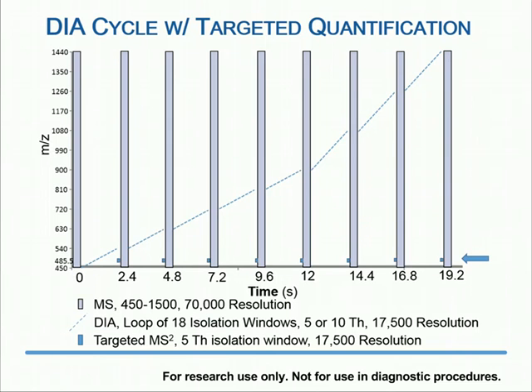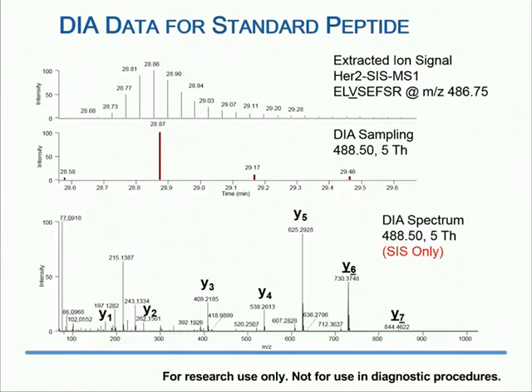If we find that we can do effective quantification, capturing these in the same tandem mass spectrum with a single spectrum, what we would probably do is just tune all of our DIA windows to make sure that they were centered to capture the endogenous and the stable isotope-labeled standard. But for this point and for the data that we already have, we think adding the targeted MS2 is a better approach.